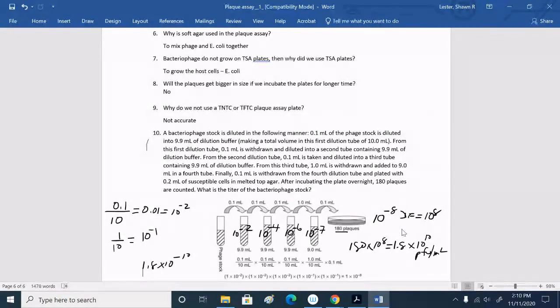So how can you get a concentration above 1? That's an example of where you look at the answer and say, does that make any sense? And obviously no, because you can't calculate something that's greater than 1 if your standard is based on values that are all less than 1, right? It's just an example of how you should look at your final answer and ask yourself, does that make sense?